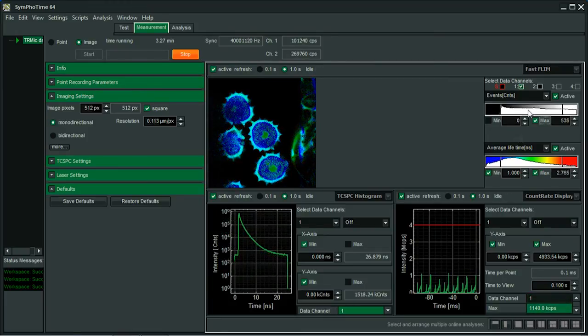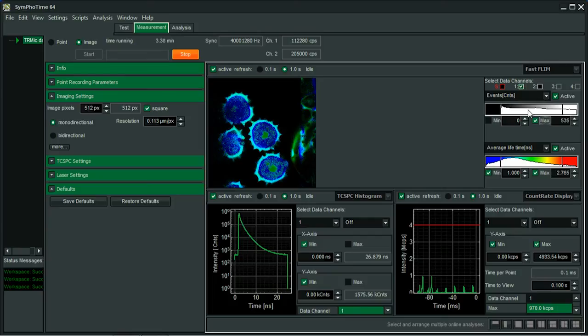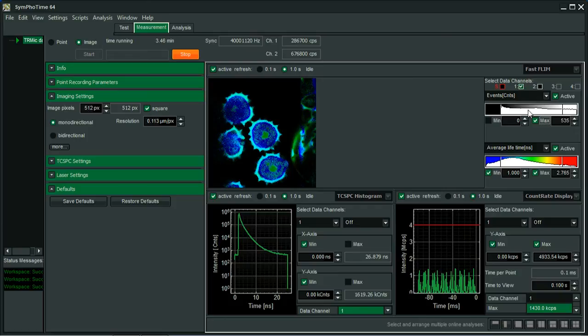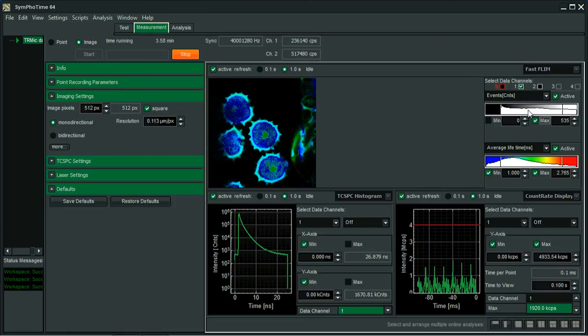So it's always a question when to stop a FLIM measurement. This of course depends on your sample. But typically, if you don't have an idea and you're doing your first measurements, as a rule of thumb, you can stop when the brightest pixels have acquired let's say 1,000 photons.